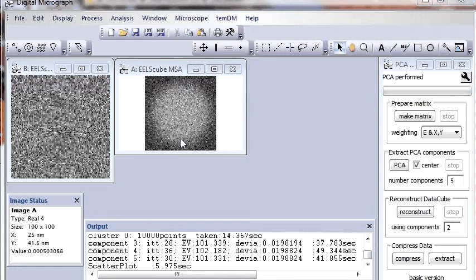Well, in the next tutorial I will show you in detail how to extract all information from this metrics and display it at any moment. This feature is very different from other software packages for multivariate statistical analysis. Typically, they would create an individual folder for each of your datasets, and inside this folder you will find 10, 20 or 100 files, and very quickly you will be overwhelmed with this huge number of files.